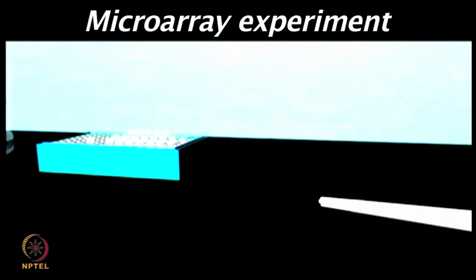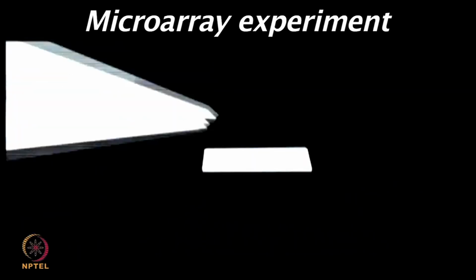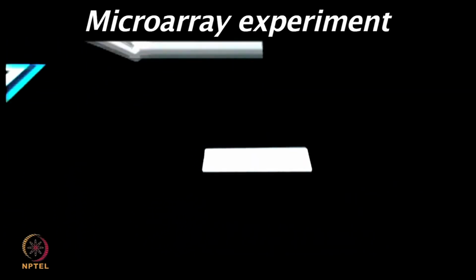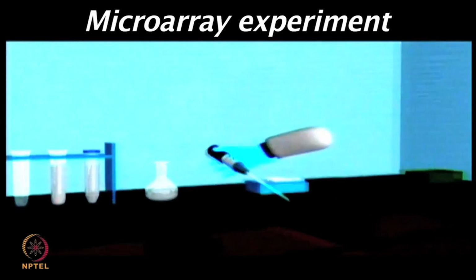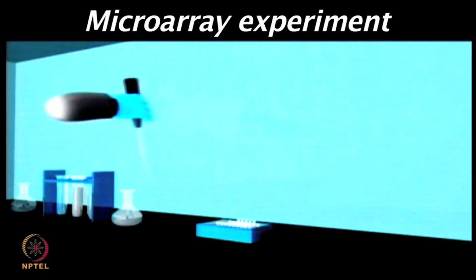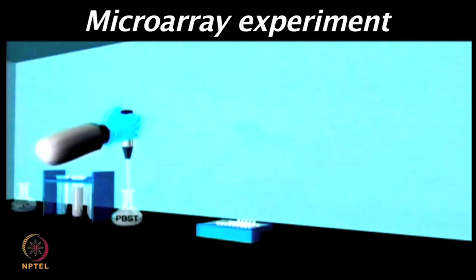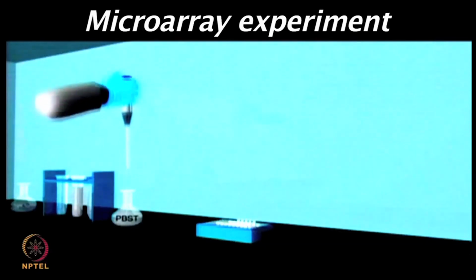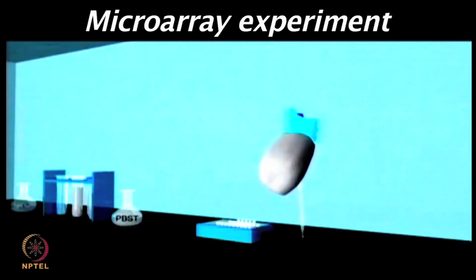But there are different investigators who use different strategies for identifying the signals. For example, your secondary antibody could be conjugated with HRP based systems. If that is the case, then one can even use a tyramide signal amplification system. So, TSA reagent is a tyramide molecule which is linked to a label.